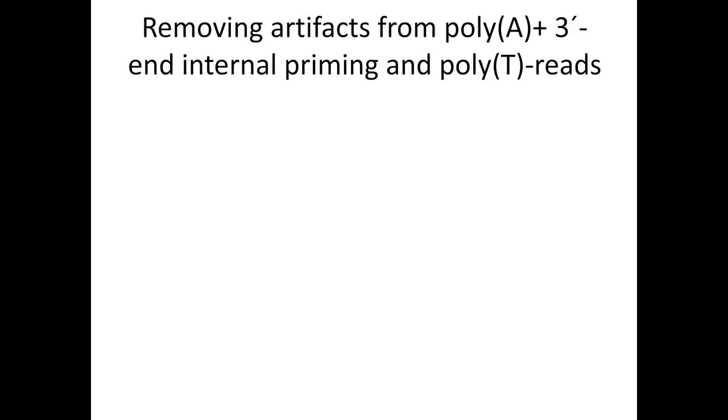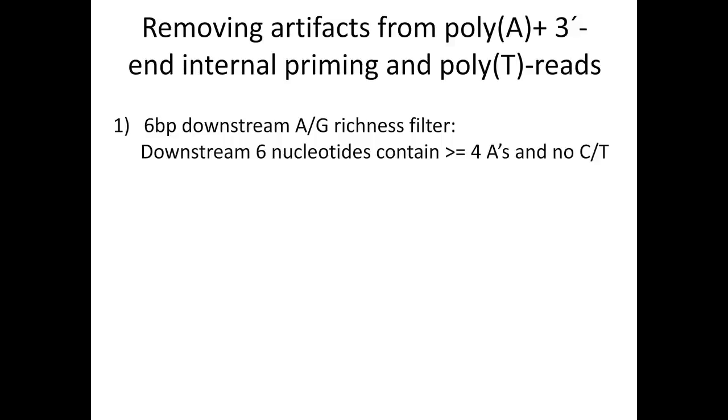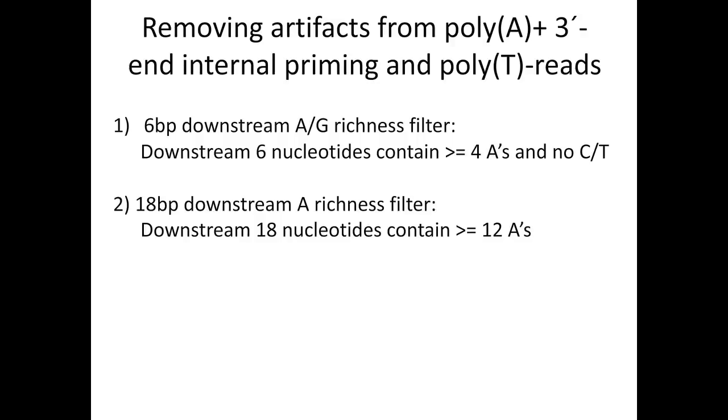So based on all of these artifacts, we developed a computational filter that would improve the quality of the 3' ends that we identify. The first filter utilizes the 6 base pairs downstream of a poly-A site, and it looks for whether or not there are A's and G's. If there are more than 4 A's and no C or T, so in other words, up to 2 G's and 4 A's, then this is likely an artifact, and so we screened those sites out. Another filter looked at the 18 base pairs downstream of the poly-A site.